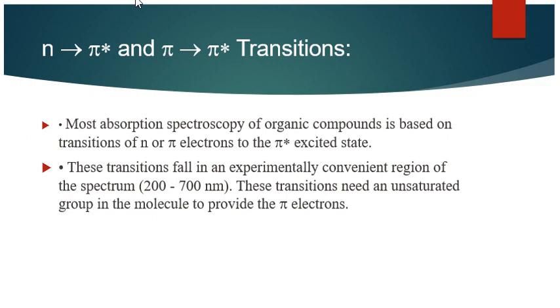If the photons have energy a little bit lower than this energy difference between two energy levels, or higher energy than the energy difference between two energy levels, then no transition will occur. A transition will only occur when the energy possessed by the photon is equal to the energy gap between two energy levels.